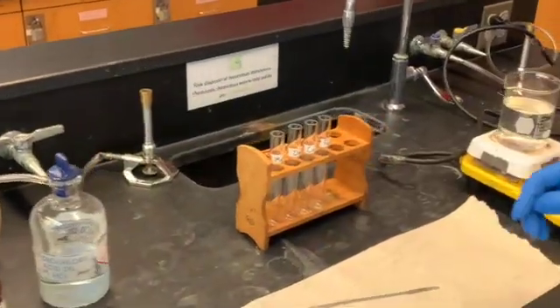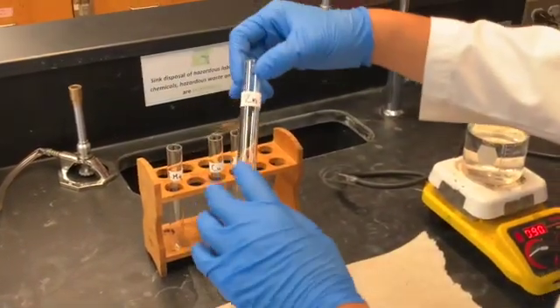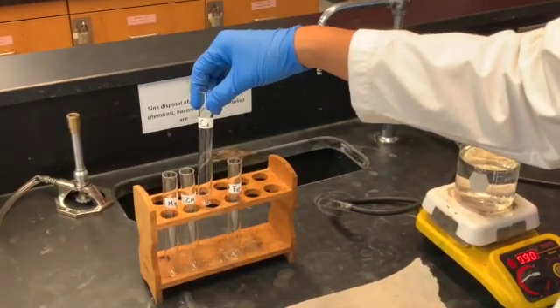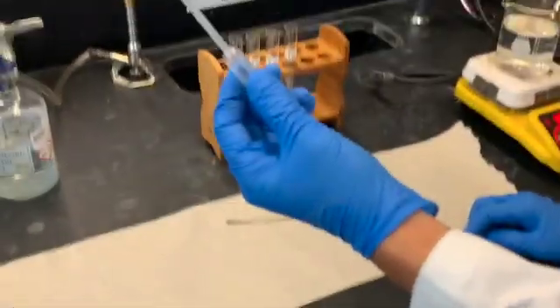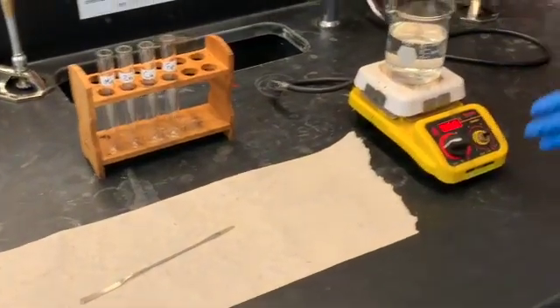The equipment that we'll be using are a test tube for magnesium, a test tube for zinc, a test tube for copper, a test tube for iron. We'll also be using a transfer pipette, a spatula, and a hot water bath.